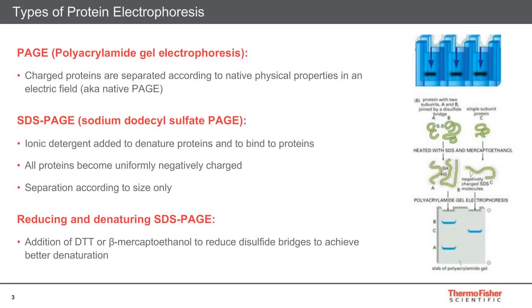I will also talk about how precast gels can contribute to protein modifications during electrophoresis, followed by how that information will help in selecting the right gel for a specific research application. And finally, I will go over a few slides highlighting improvements within precast gel options.